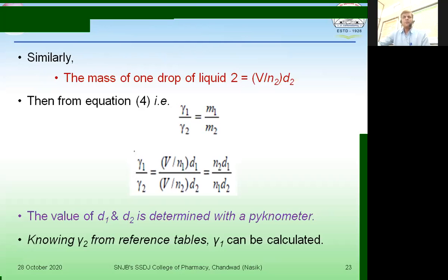The lower end of the stalagmometer will be dipped into the liquid in the beaker, and we will allow the liquid in the stalagmometer to start forming a drop when the lower end touches the liquid in the beaker, and to run from mark A to mark B. We'll reverse the process.